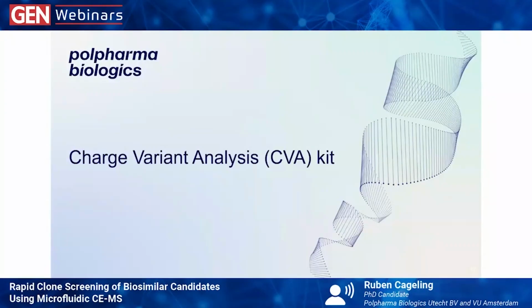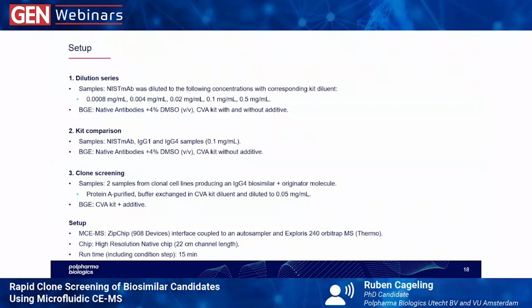Well, then I would like to talk a little bit about something else. Thanks to 908 Devices, we were also able to test the charge variant analysis kit. And this we did in 3 different experiments.